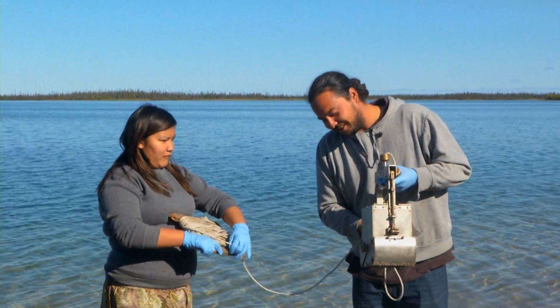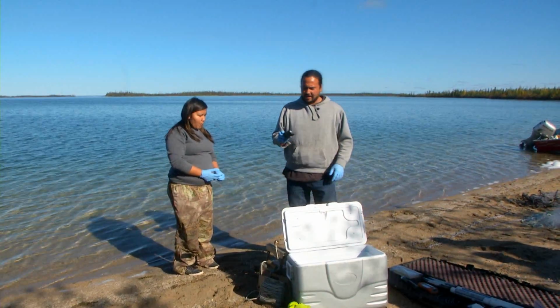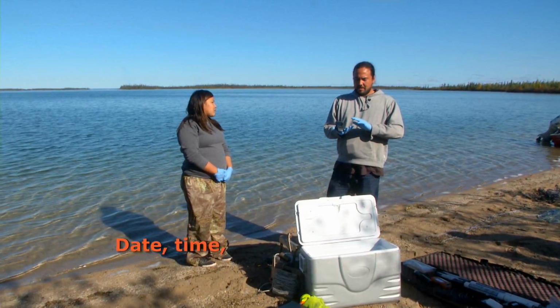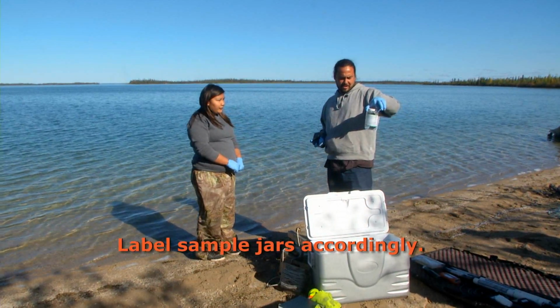Yeah, and watch your fingers on these. These are spring activated. The young guys and women here, we're gonna have them use the GPS. For every location, we're gonna want the day, the time, and we want the GPS coordinates. And we'll actually have to put that on to every sample jar.